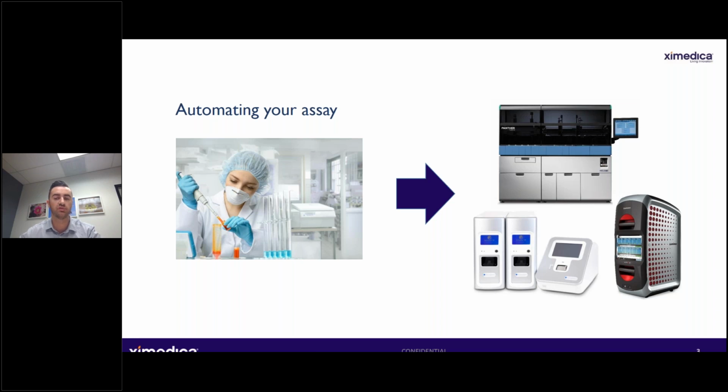And the justification behind this move is pretty obvious. A fully automated system frees up our valuable lab technician time. It can decrease the chance of contamination in the lab. We can improve reproducibility amongst a host of other advantages. Some solutions out there don't offer full walk-away automation, and they've still found a place in the market, as long as the most laborious protocol steps have been automated. You can see that in a number of systems out there that have separate processors and readers.